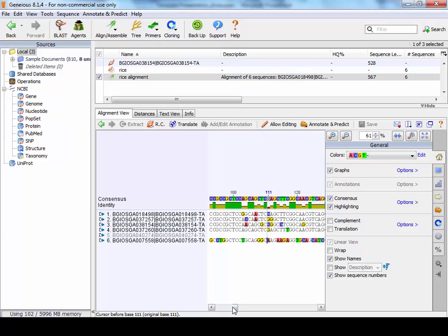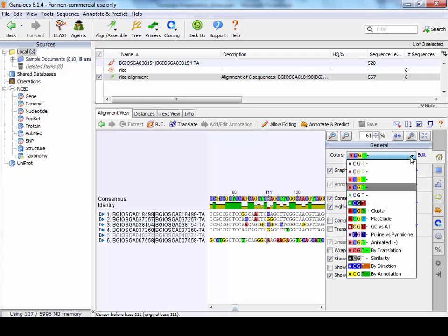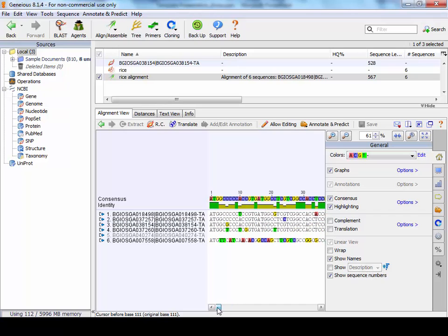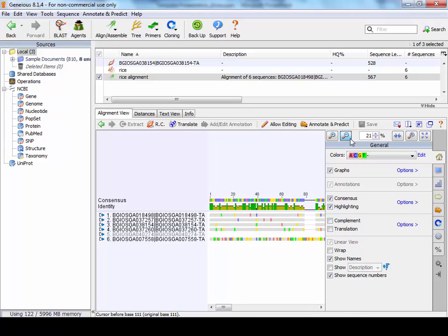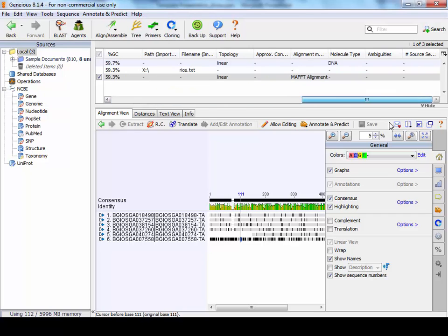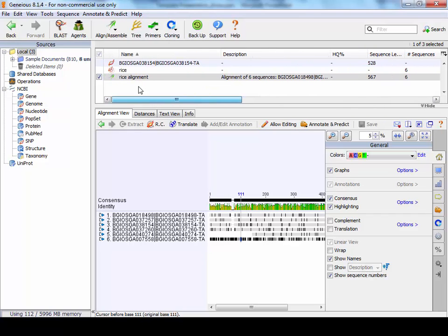And then what we have is the alignment. And what you'll see is those differences are highlighted, and you can change that in this right-hand panel. And then look at those sequences in a bit more detail. So this is basically the basic use of Geneious.